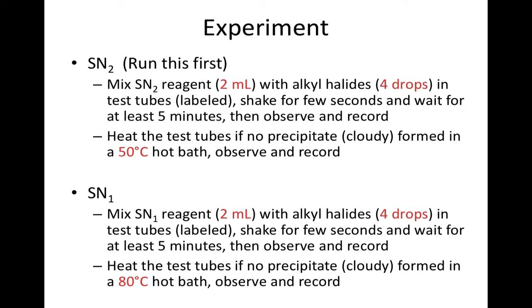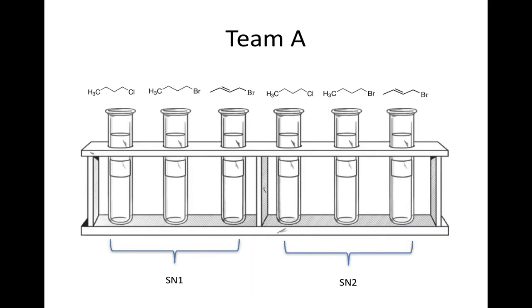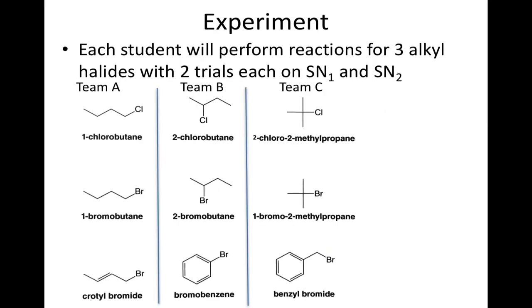To perform the reaction, we will mix 2 mL of the reagent and 4 drops of the alkyl halide in test tubes. Mix well and observe if a precipitate forms, recording the time needed for it to appear. If no precipitate forms at room temperature, the test tube is immersed in a hot water bath and observed again. The hot water bath for SN1 reaction is 50°C and 80°C for SN2 reaction.